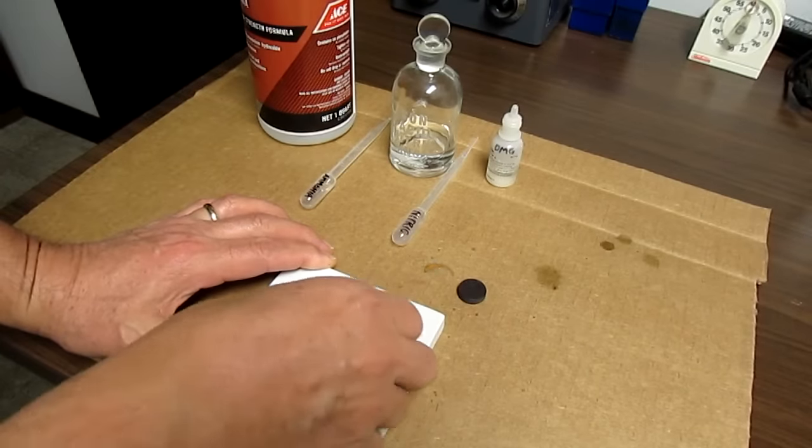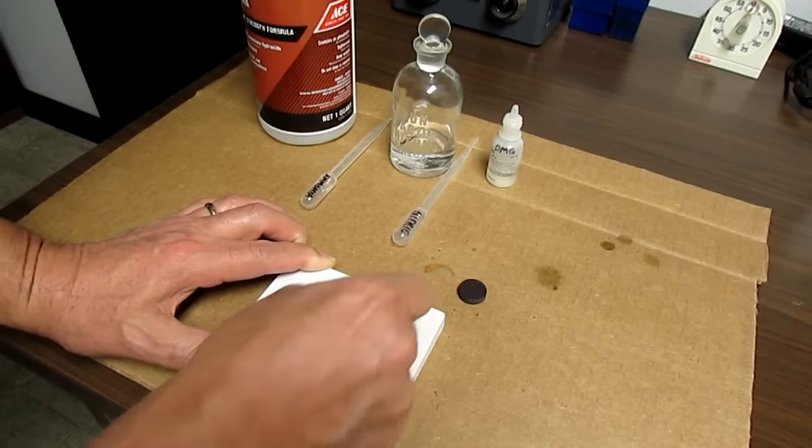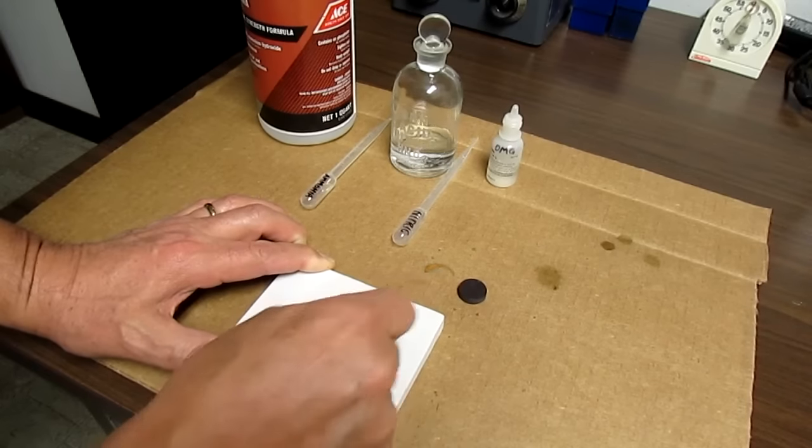To start the experiment I'm going to go ahead and rub a piece of the nickel on the bottom of a spot plate here to make a little streak.